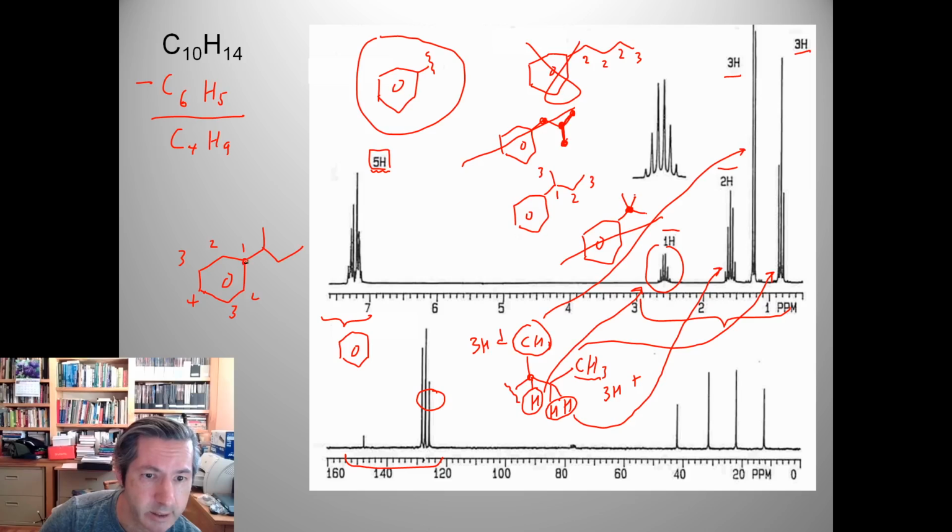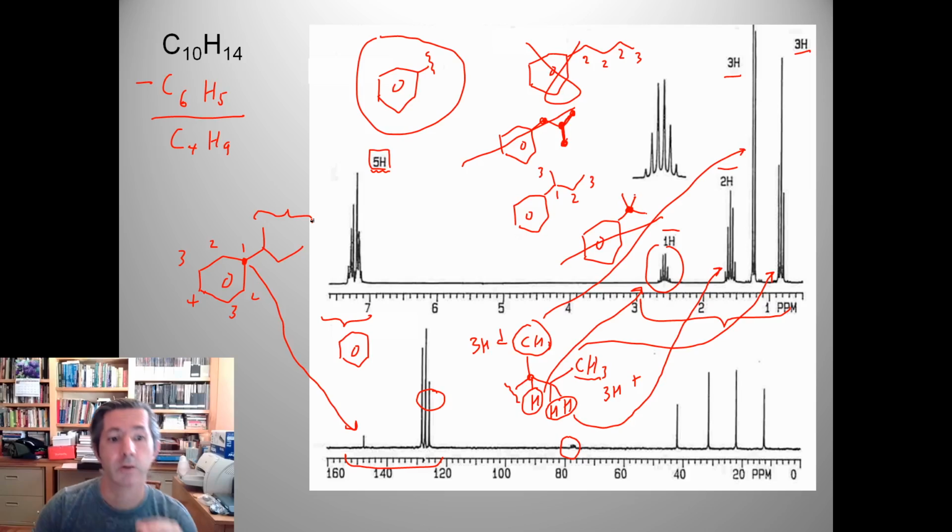But we can say pretty surely that carbon number 1 has to be this guy, because he's very small, no attached hydrogens. Other than that, we can't really read much into these signal sizes here. So you got a little bit of solvent right here, and then we have these 4 carbons corresponding to these 4 carbons. So it kind of backs up our choice here of structure. So that's for a hydrocarbon.